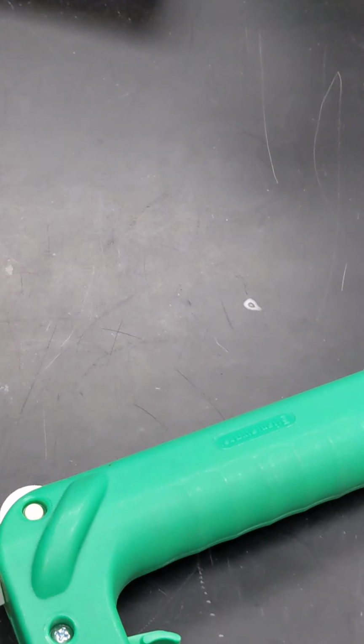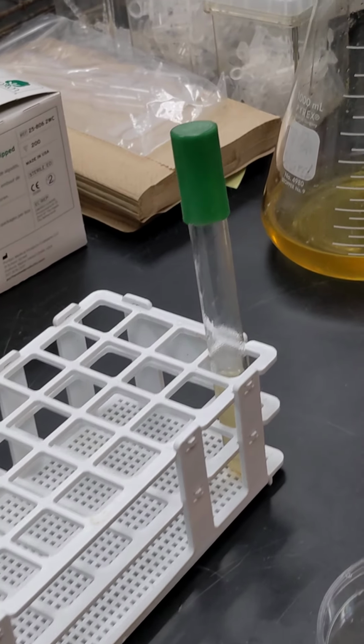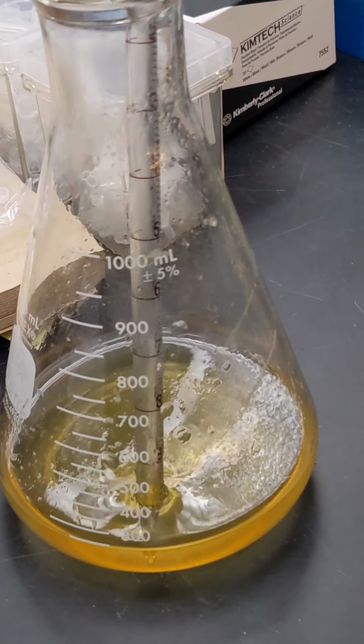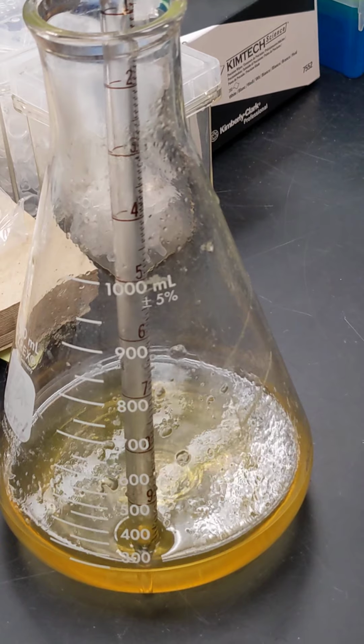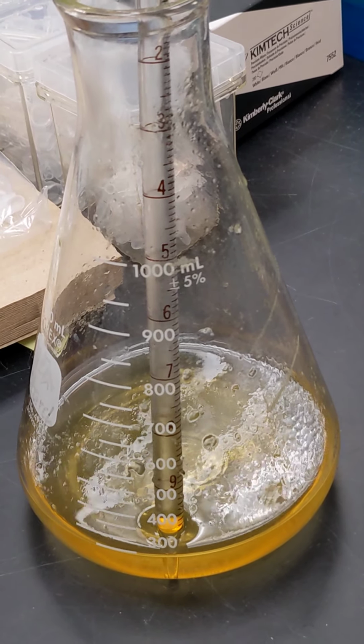I'm going to pause this just 1 second. So it's inserted like this. And then when I'm getting my media, I'm just going to put that inside of the flask, and I'm going to take up however much I want. So if I'm making a deep, I want 8 mils. Since this goes down to 10, that means I'm going to suck up to the 2.